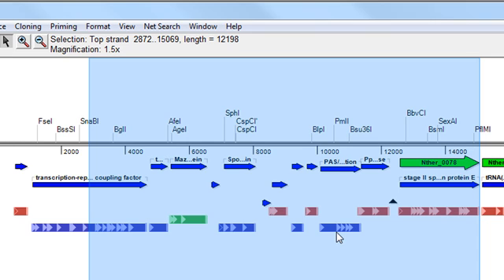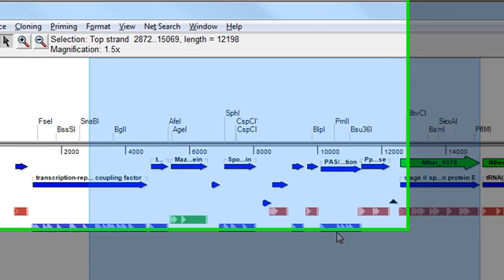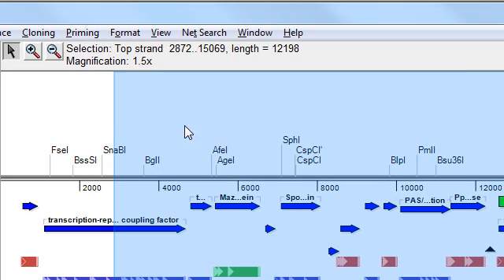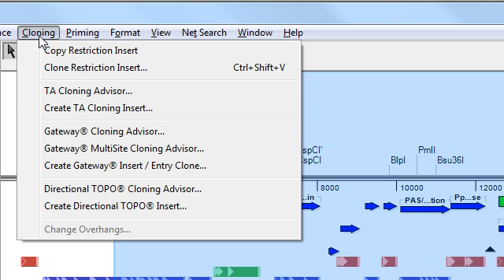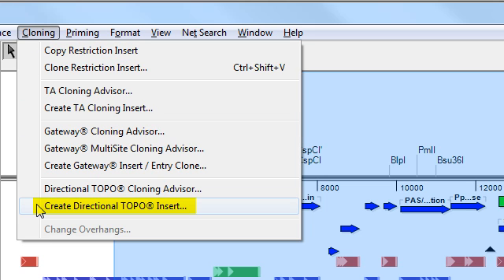If you're using Windows, hold down the Alt key. And if you're using a Mac, hold down the Option key. While you're holding down that key, click and hold on the cloning menu, and then select Create Directional TOPO Insert.